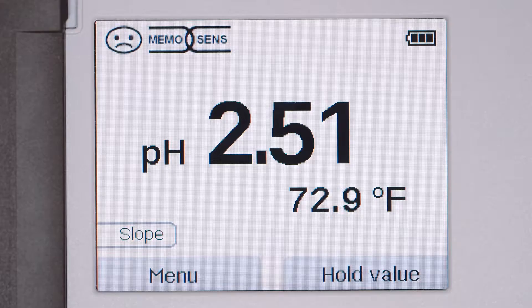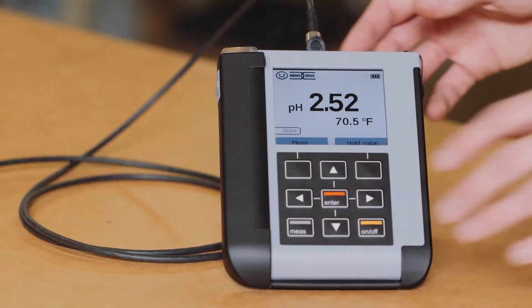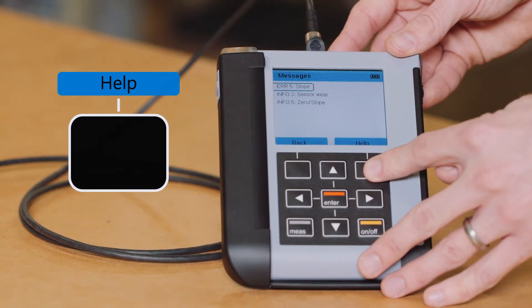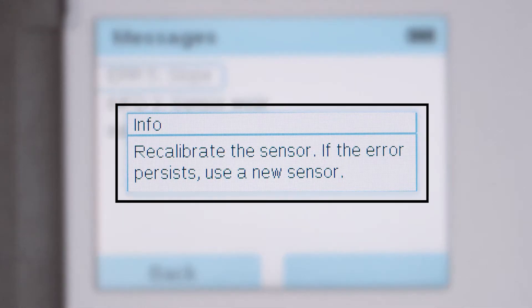Along with the Sensoface, your Portavo may also indicate error or status messages on the main screen. In this instance, further information on the message can be found by pressing Enter and then the Help soft key. In most cases, the issue can be resolved by the operator by performing maintenance on the sensor or by sensor replacement. Your Portavo will give you tips on what to do next.